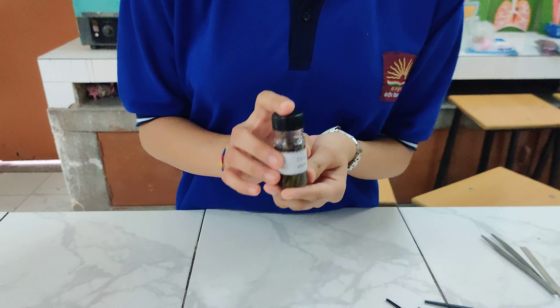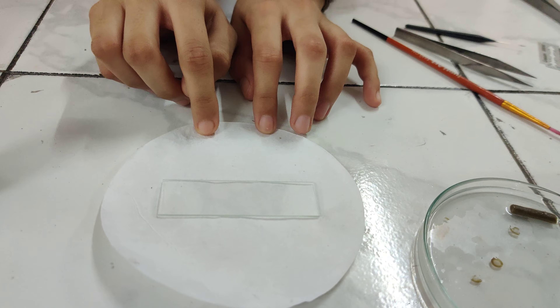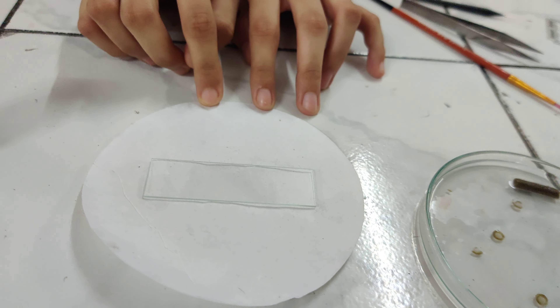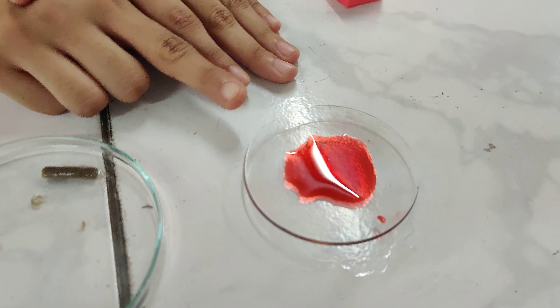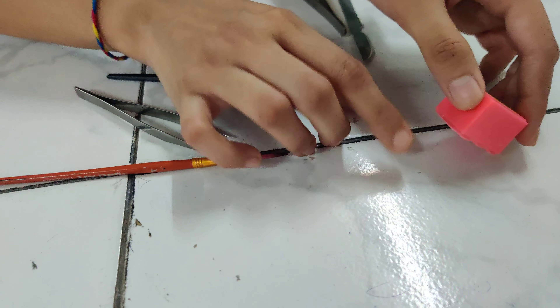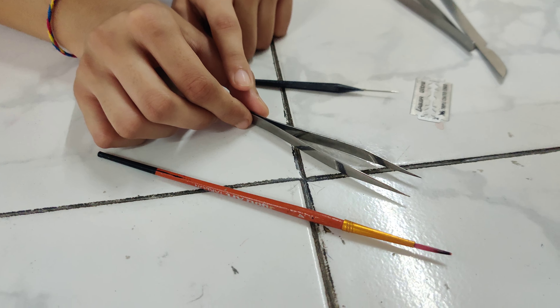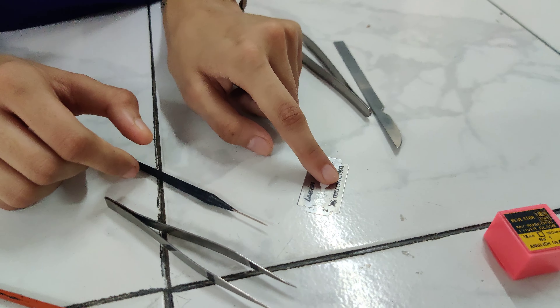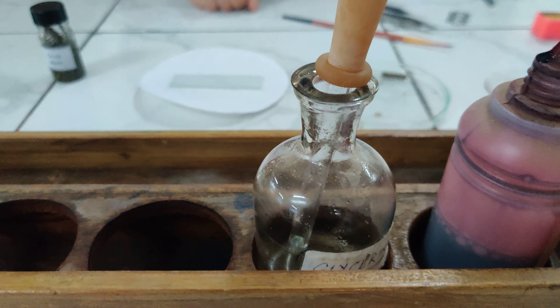The materials required are: a preserved dicot stem, clean glass slide, filter paper, petri dish with water, safranin in a watch glass, cover slip, zero number brush, forceps, needle, sharp blade, safranin stain, and glycerin.